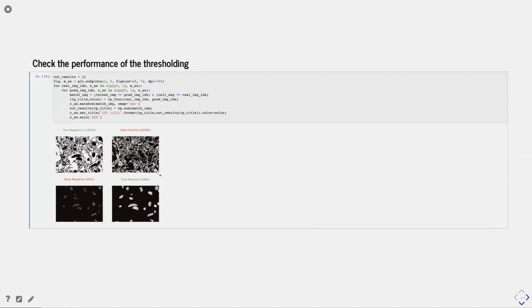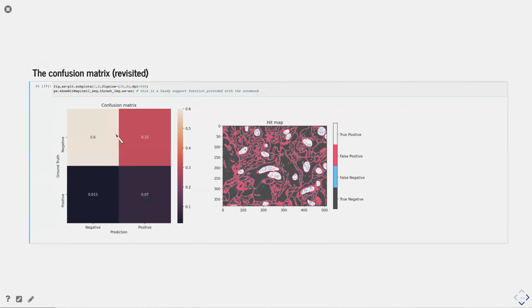The big bad one is actually the false positives. So we are saying that there are a lot more structures that should be mitochondria, but they are not actually. So all this connecting tissue and membranes, they also are classified as mitochondria, even though they are not.